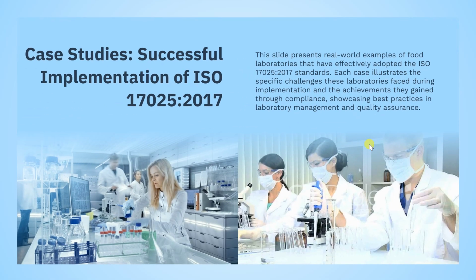Just look at them. These people are somehow not organized toward the work. They are moving toward each other. They do not attach their hair. But coming to this picture, you see that there are changes that have been made. Now the man is concentrated on his work, as well as the rest of these ladies.